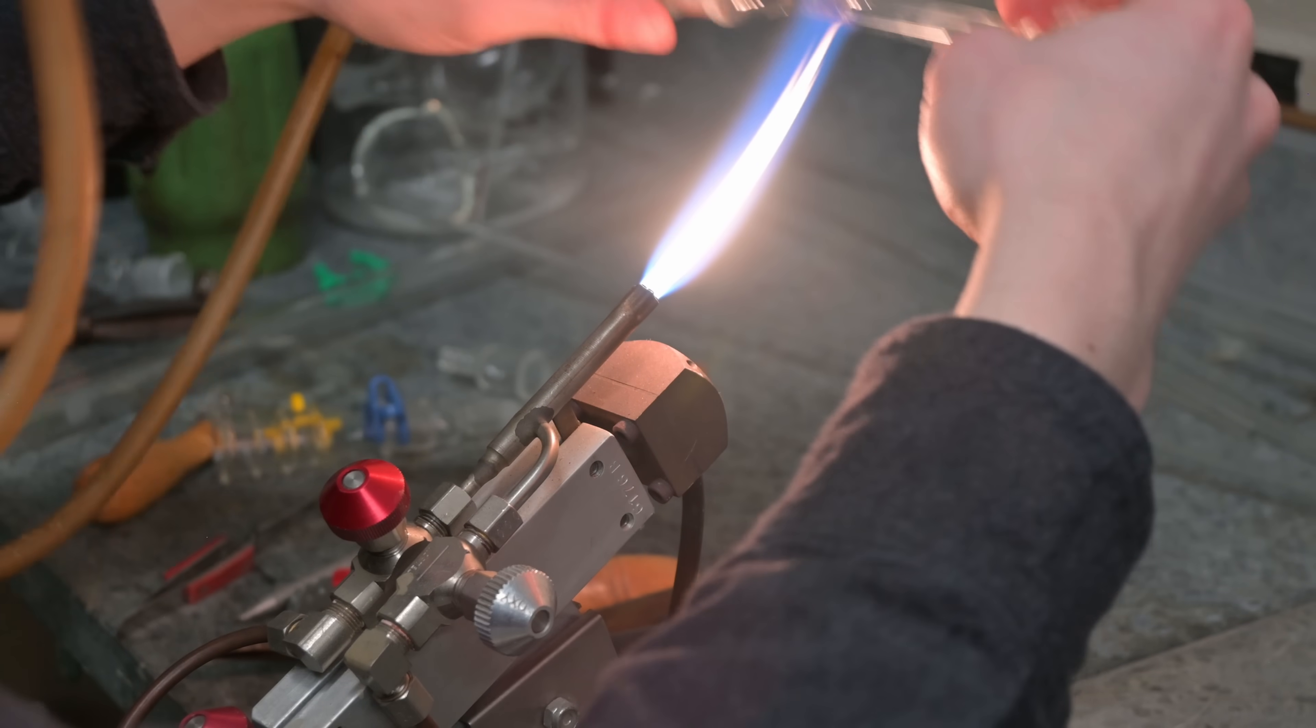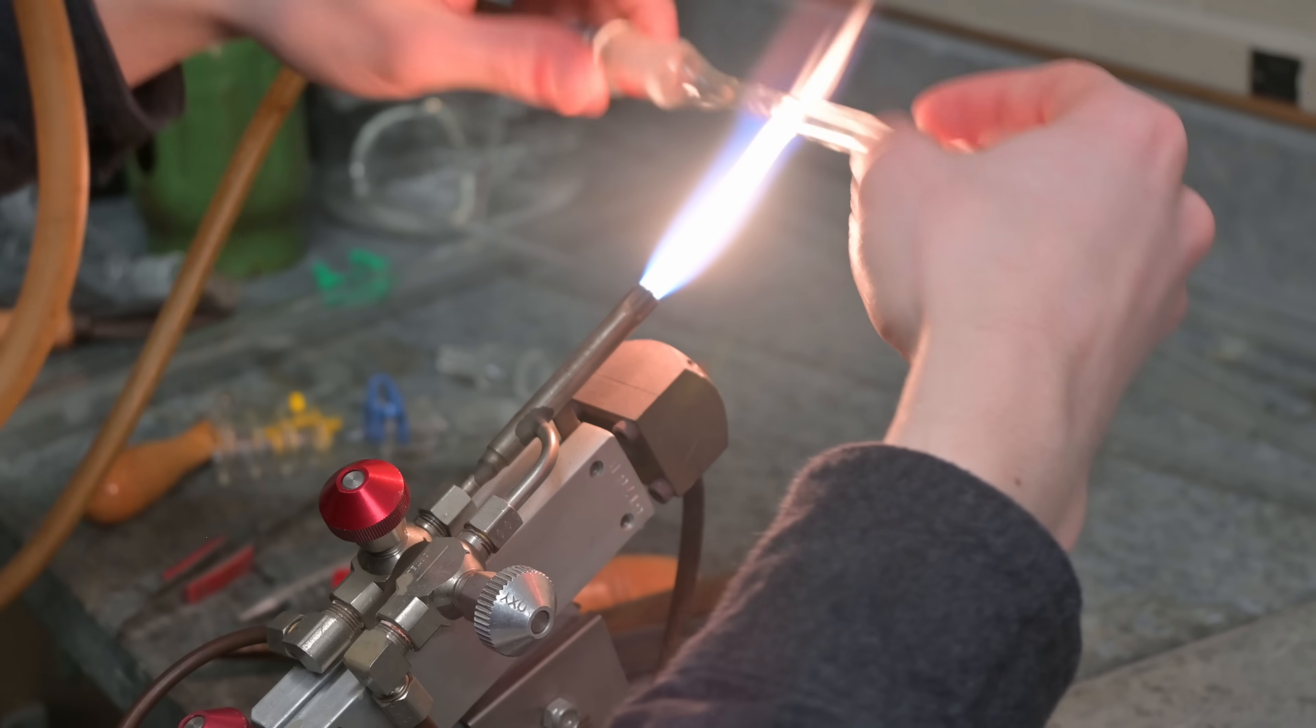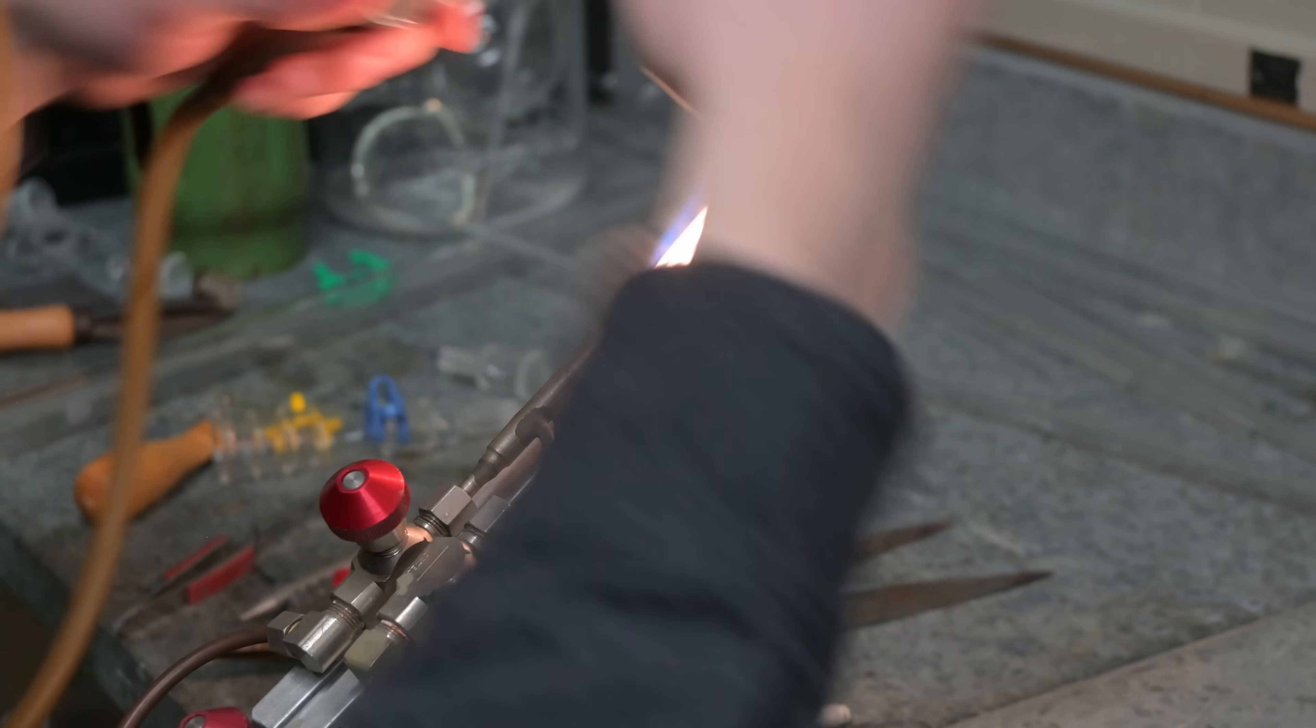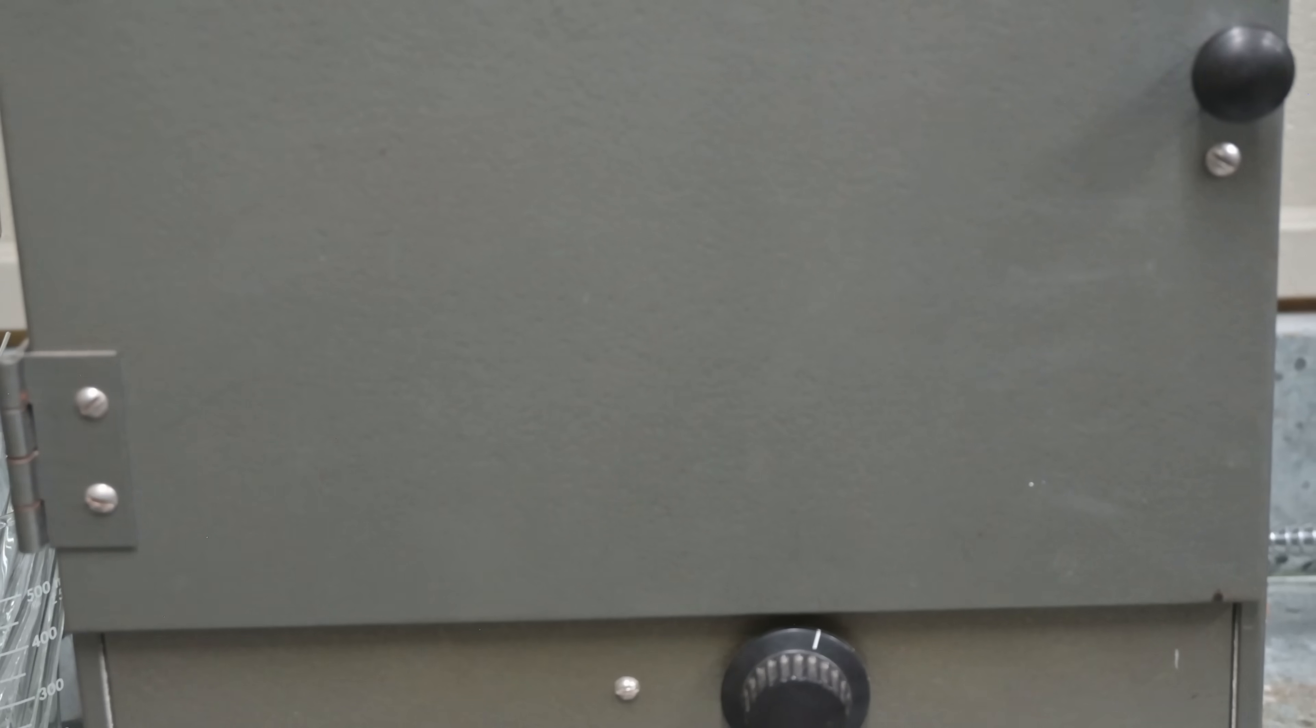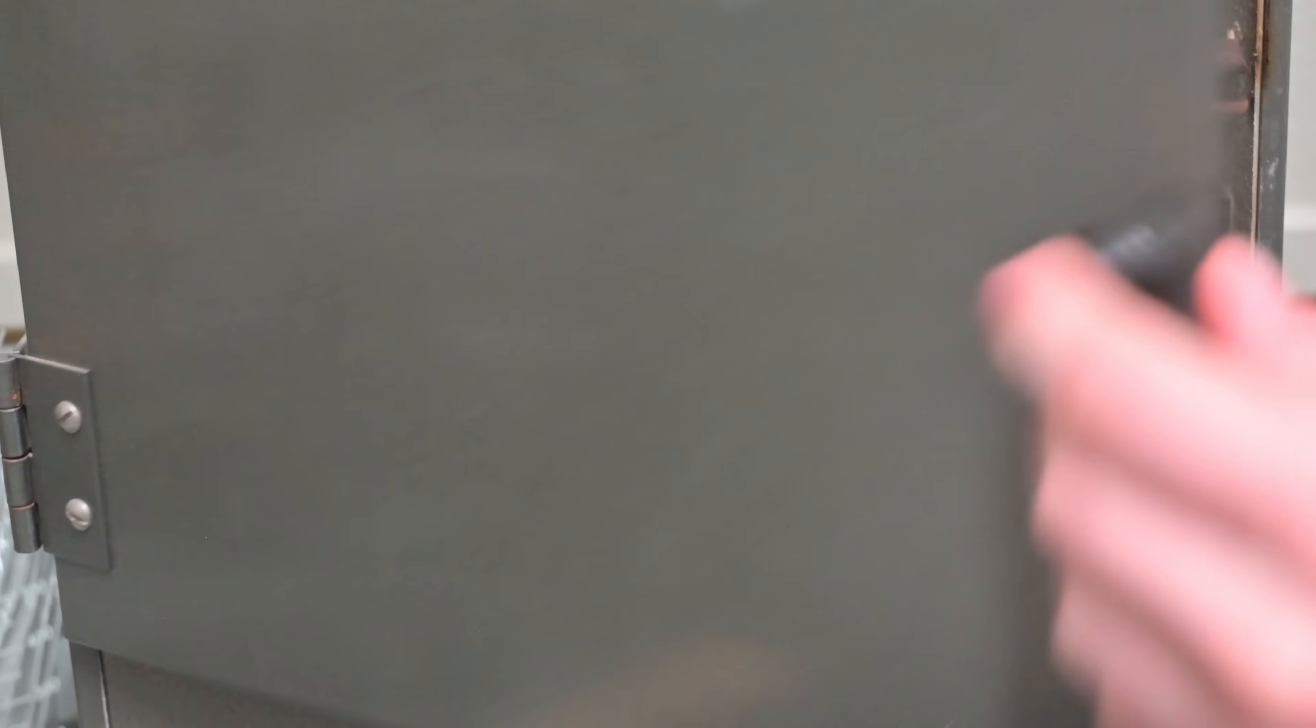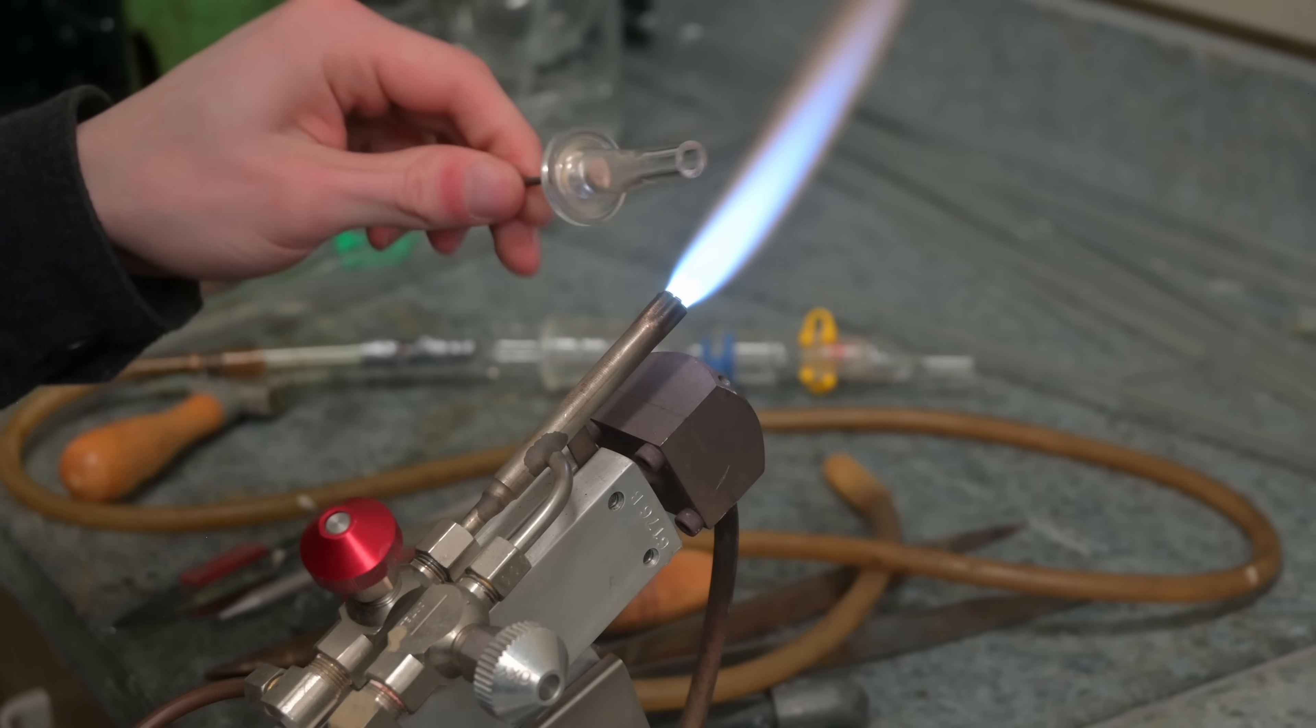Next, I gently heat the part, which will anneal it. It makes it less fragile by removing stress in the glass. After, I pop it in the oven and allow it to cool down slowly. The glass we used is called borosilicate, which is useful in glassware because it's a great ability to handle rapid temperature changes without cracking or breaking.